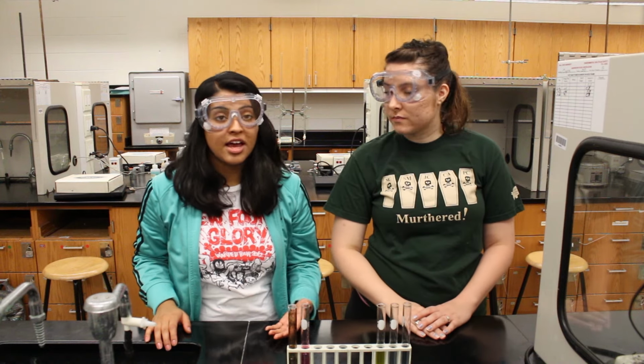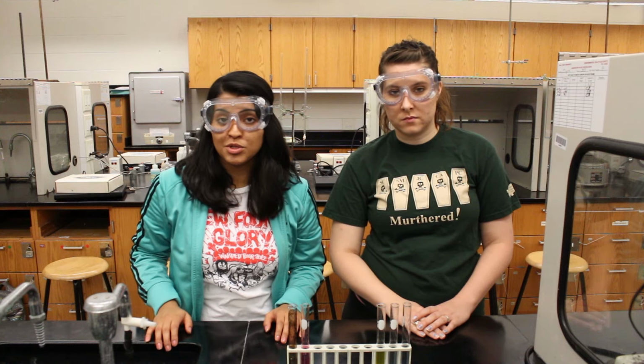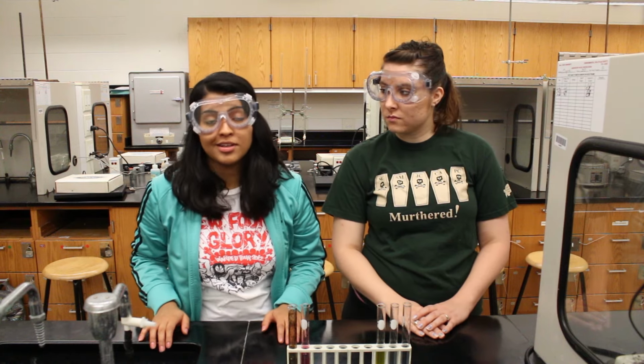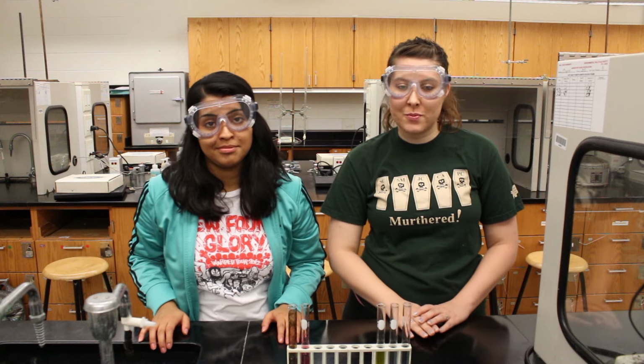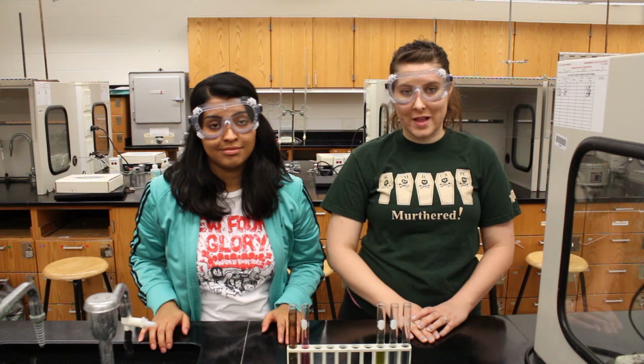In the last part of the lab, you will test the oxidative properties of both aldehydes and ketones using the potassium chromate. And remember, as always, have fun. And be sure to dispose of all waste in the appropriate waste containers and to wash your hands before leaving lab today.